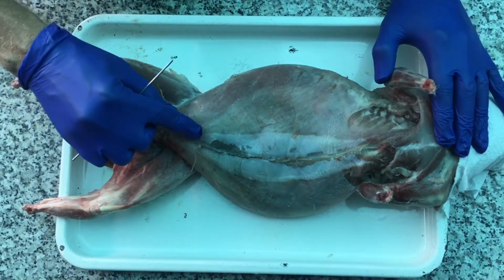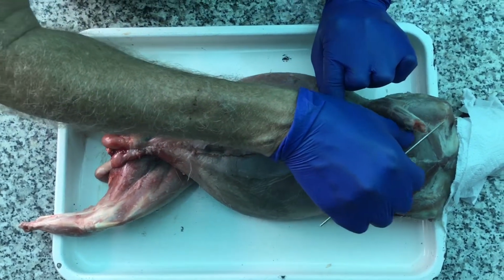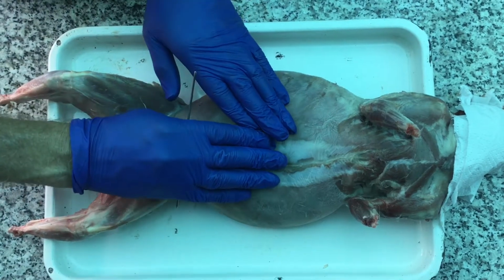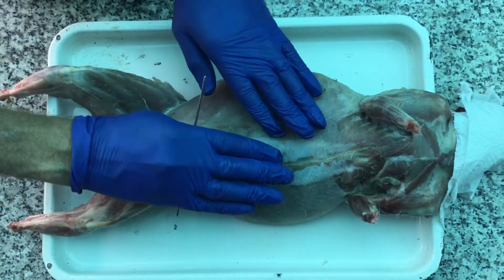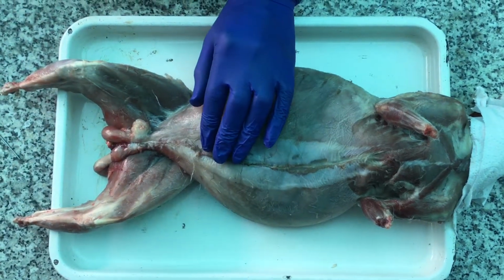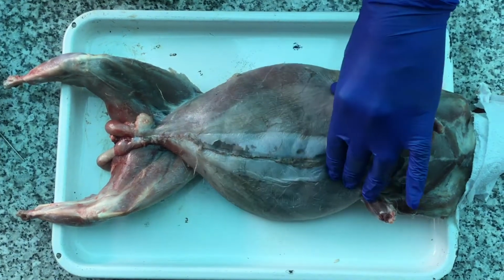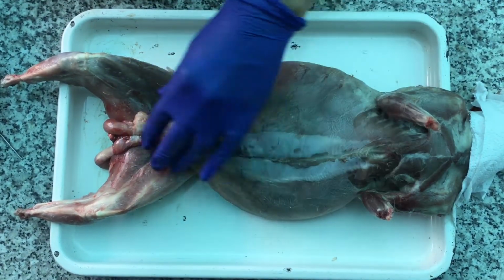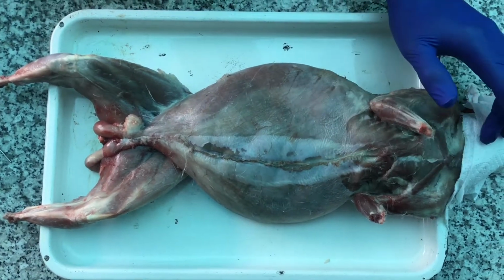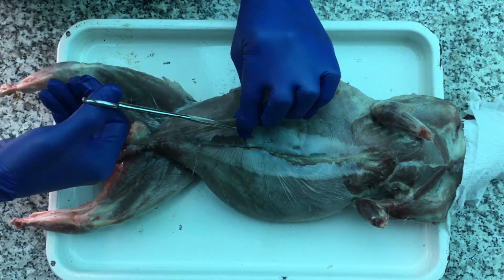And what we're going to be doing is cutting through the muscular abdominal wall and then through the muscles and also the ribs or the bones of the chest wall, opening up, exposing the inner tube of the body and opening up what we call the coelom or the body cavity. In the adult, what would be the abdominal cavity down here, inferior or caudal to the diaphragm, and up here the chest cavity, superior or cranial to the diaphragm. So I'm just going to start by cutting into the abdominal cavity.